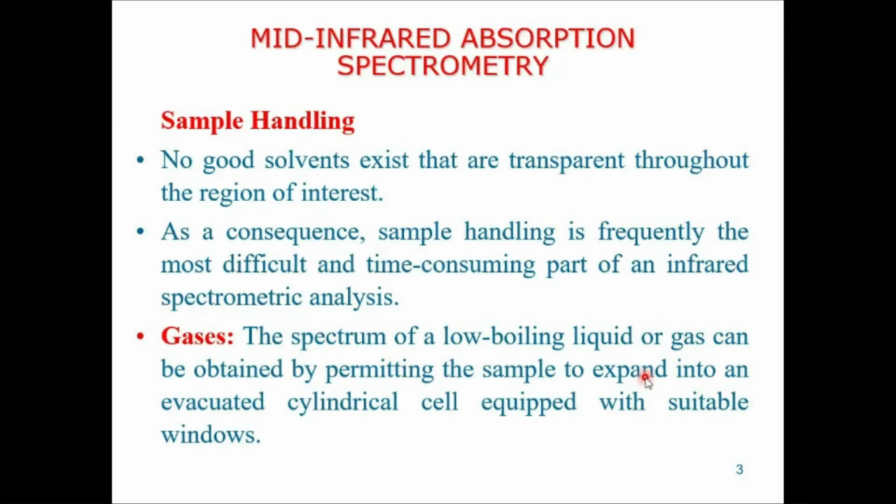So let's start sample handling. No good solvent exists that is transparent throughout the IR region. As a consequence, sample handling is frequently the most difficult and time-consuming part of IR spectrometric analysis.